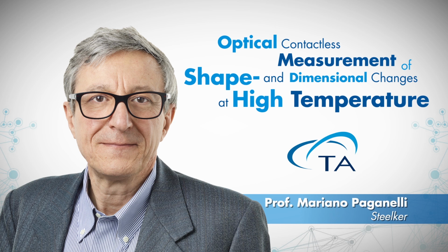This becomes crucial when the sample is sintering with the viscous flow of a glassy phase, and if you do the test with the horizontal optical dilatometer, the specimen may stick on the sample holder. The problem is not the fact that at the end of the test you have wasted the sample holder. The problem is that, sticking on the sample holder, it will not shrink as it would if it were free. So when we test material that may stick on the sample holder, it is always preferable to use the vertical dilatometer in order to get more accurate results.